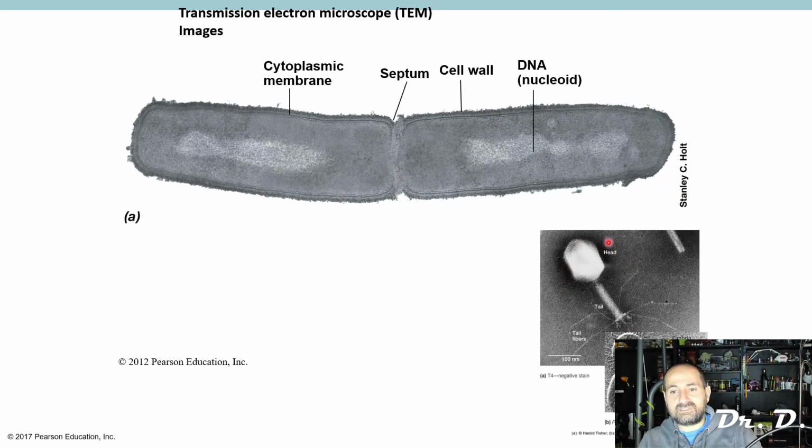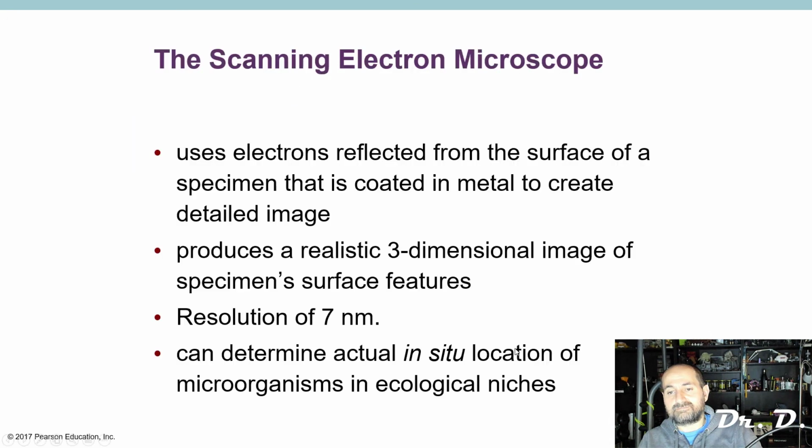Down here you can see negative staining with electron microscopy of a virus, what's known as a bacteriophage, a virus that can infect bacteria. Notice how the virus is not stained, but the background is. That's a negative staining procedure. And then look here, to reveal the flagella on this bacteria, Proteus mirabilis, you can see there's been shadowing, where the metals are on the bottom side of these flagella.